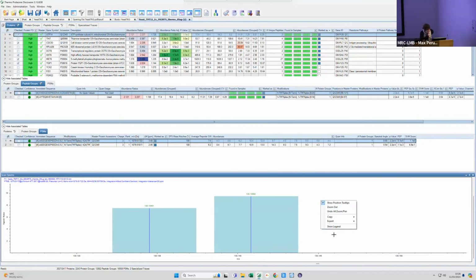Right. Anything else? Do you have any questions? Don't worry if you don't. Whenever you have your result file, whenever you don't understand something, or whenever you want to apply a filter and don't know how to get to that, let us know. Come on downstairs, we can help you. I know that there are a lot of people that have problems because unfortunately PD is PC bound. We'll have a couple of PCs in the facility where you'll be able to log in, work with your project, and then log off. So this is on the way.